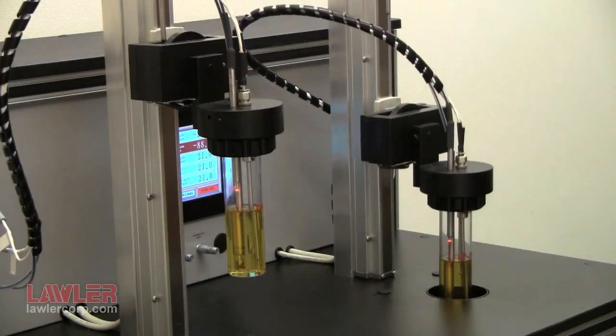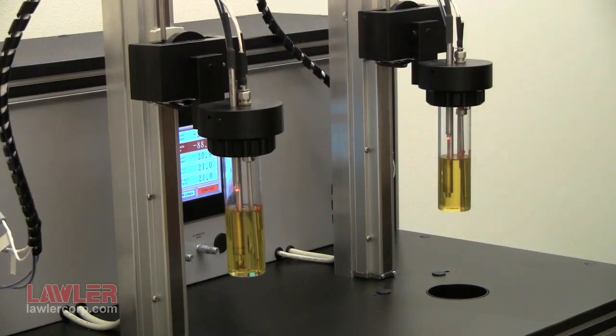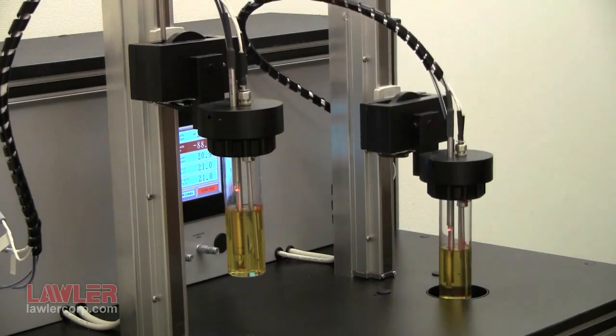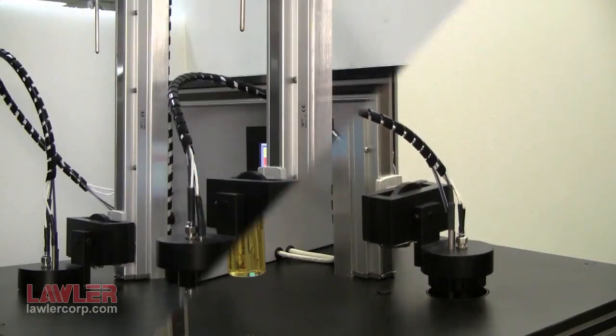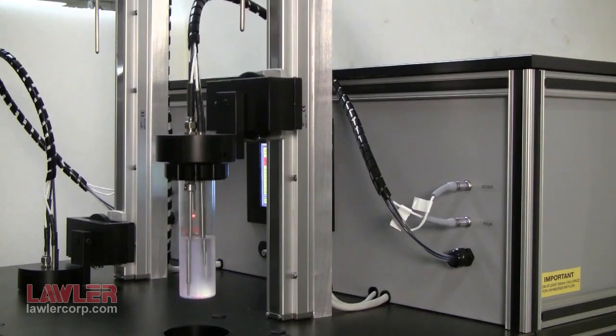It lifts and tilts the sample until movement is detected, up to a maximum of 90 degrees. A pour is detected, so the arm returns the sample for further cooling and the process is repeated.